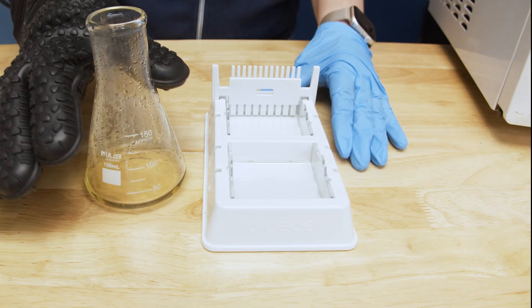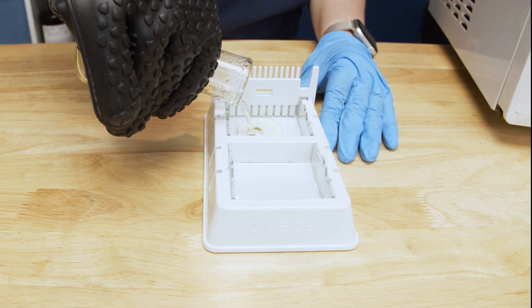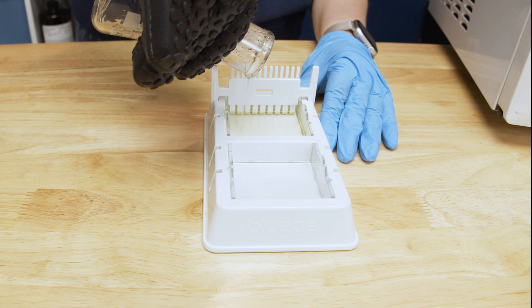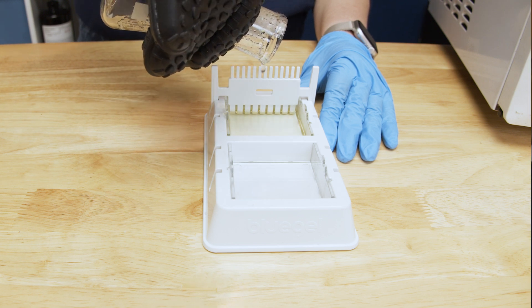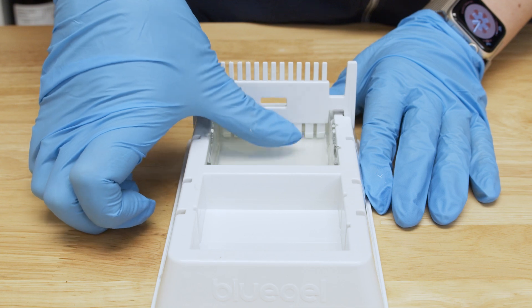Once you have prepared the agarose solution, pour it into the assembled gel casting tray. You can pour the agarose solution immediately into the tray — you do not need to wait for it to cool. The gel will set in about 10 minutes. Once cooled, it should feel firm like jello.